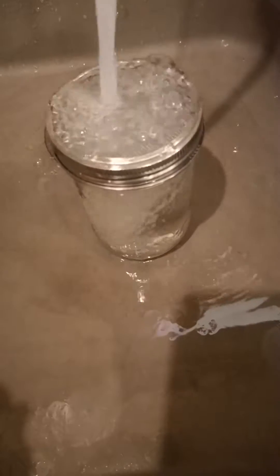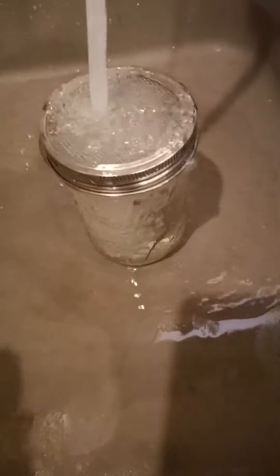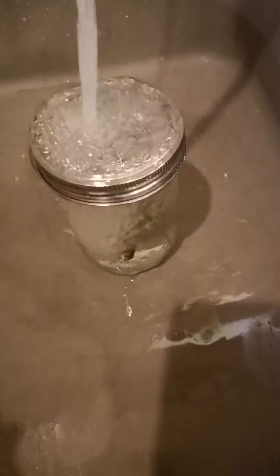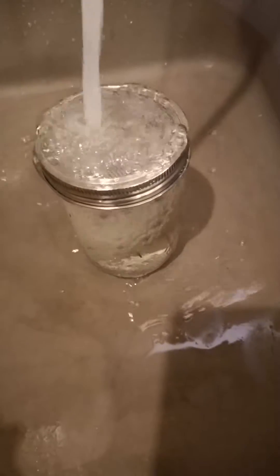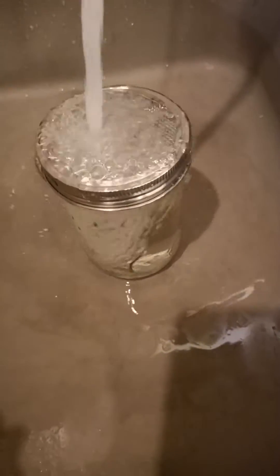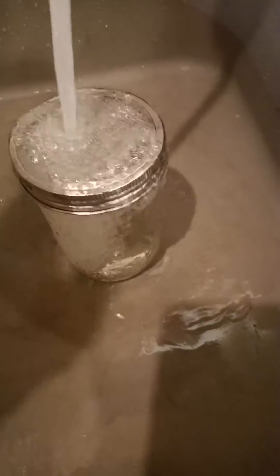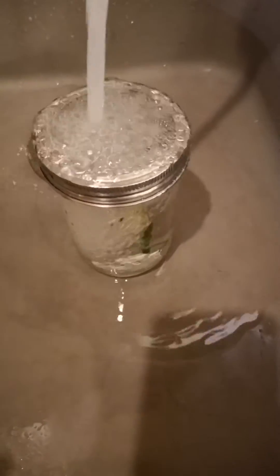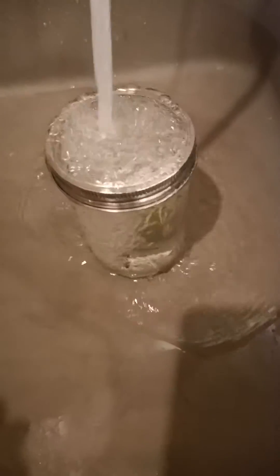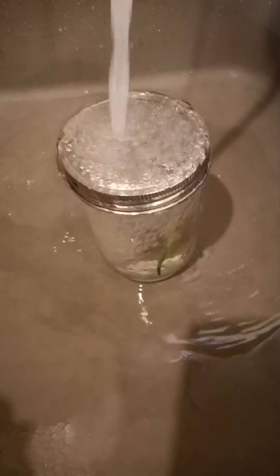Some protocols call for 20 or 30 minutes to do this. I usually don't do it that long. This stuff was grown in bins, covered up inside in the grow house, so it's going to be relatively clean. But if you get something from outside or submerged in your aquarium, you might want to rinse it a lot longer because you're going to have a lot more contaminants, especially if it's under water and under soil. Next, I'm going to put it in a sealed container with a 20% bleach solution.